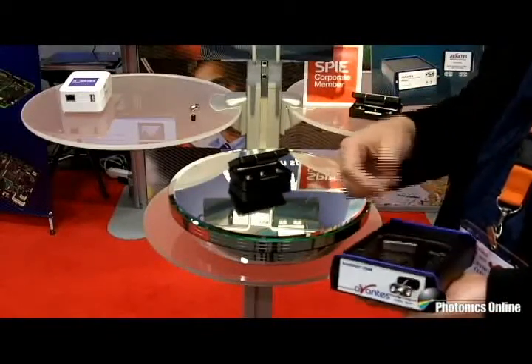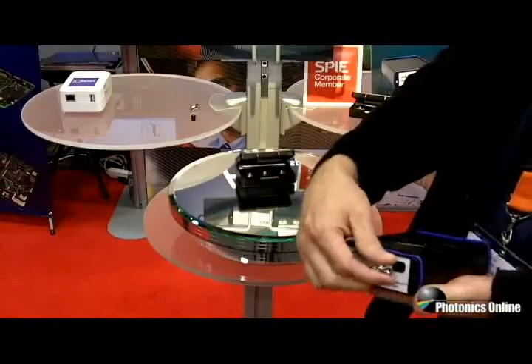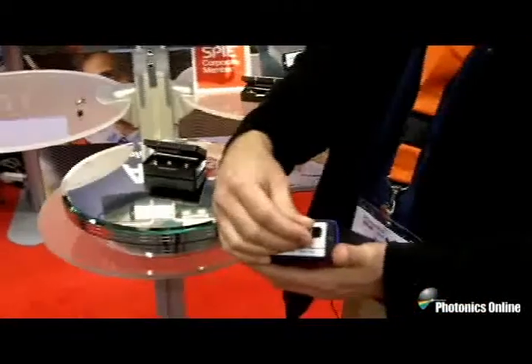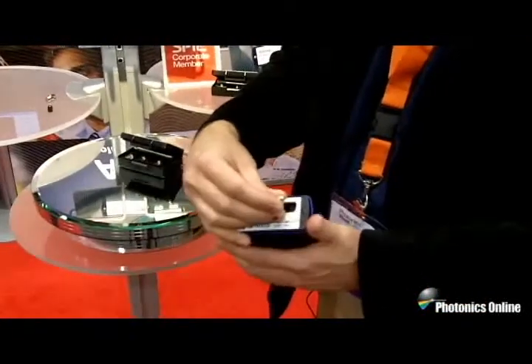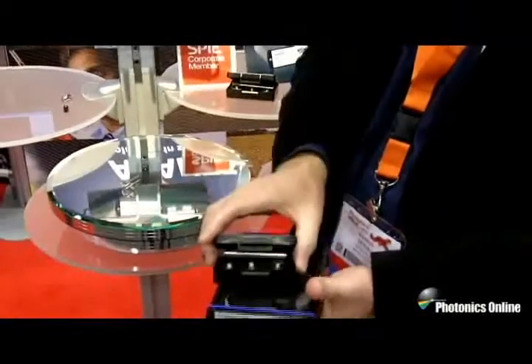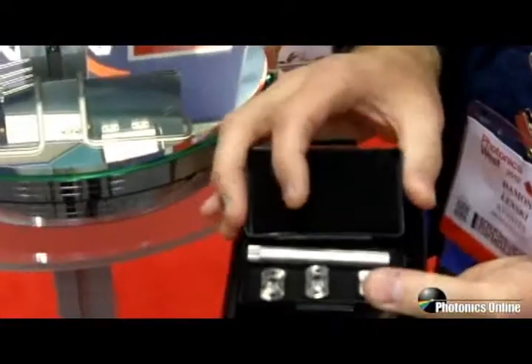But up until now it is available with the new RS feature on AvaSpec spectrometers. The AvaSpec comes with a slit installed, and independently customers can buy our slit kit. The slit kit comes with three individual slit sizes.